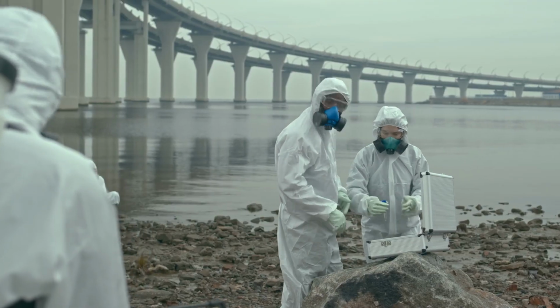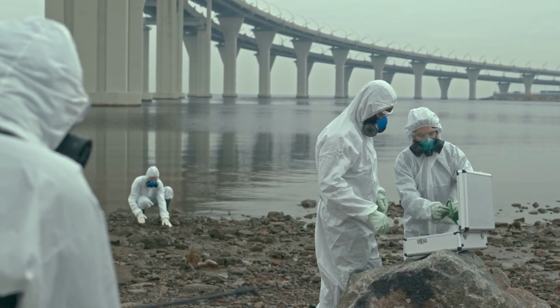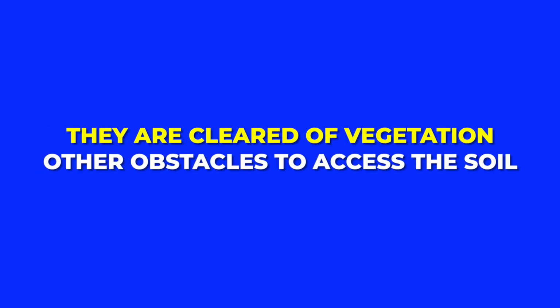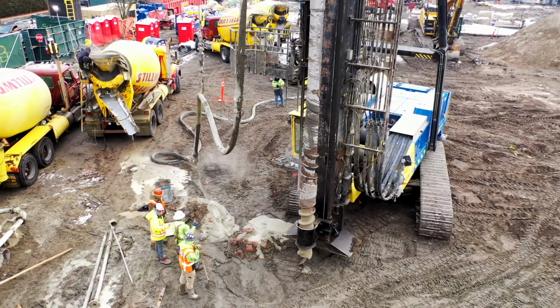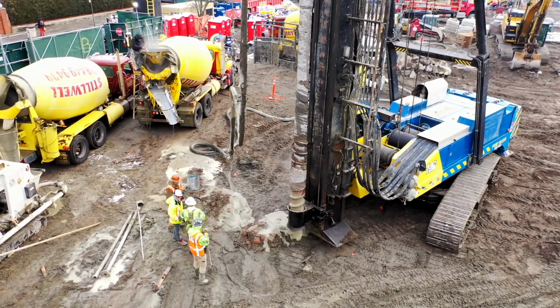The sampling process begins with a qualified consultant who first assesses the site to determine the best areas for sampling based on ground conditions and historical use. Sampling areas are typically 0.5 metres by 0.5 metres. They're cleared of vegetation and other obstacles to access the soil. Using proper safety gear, including respiratory and personal protective equipment, is mandatory to minimise the risk of asbestos exposure. The consultant applies a fibre suppressant to the soil to control any potential asbestos dust before collecting samples.